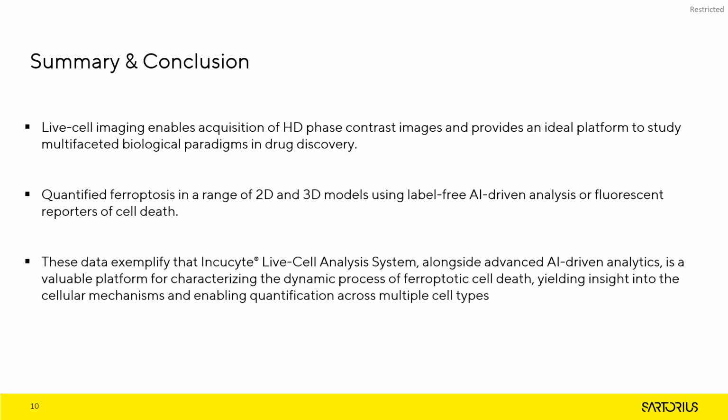So in summary, live cell imaging enables acquisition of high-definition phase contrast images and provides an ideal platform to study multifaceted biological paradigms in drug discovery. Here we've quantified ferroptosis in a range of 2D and 3D models using label-free AI-driven analyses or fluorescence reporters of cell death.